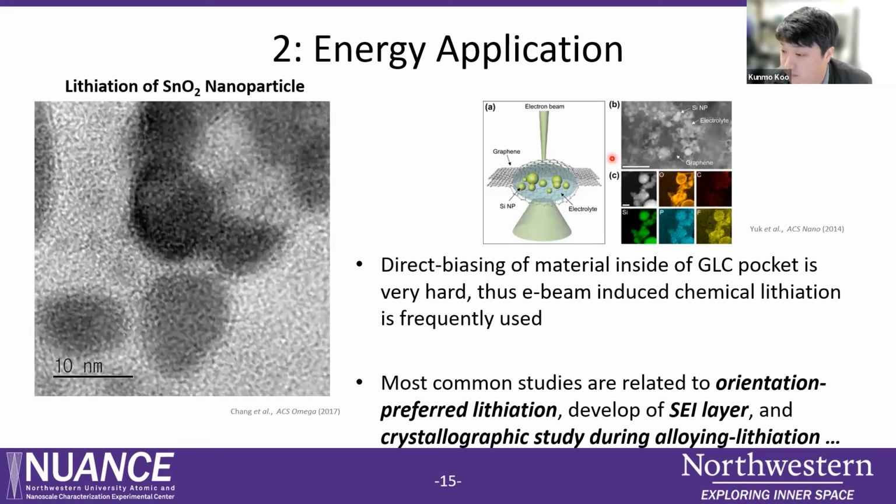Hi, this is Dieter Isheim. I had a question: how important and how difficult is it to really get a single graphene layer at the top and at the bottom? Are there any studies on what happens if you have 2, 5, 10 graphene layers in a stack? And if there are, how thick can the graphene be until you run into other problems like handling it or it not being electron transparent anymore?